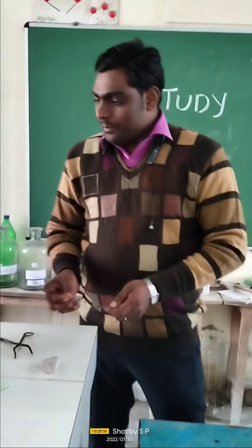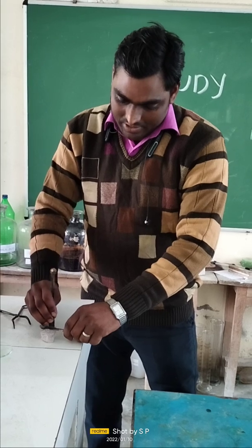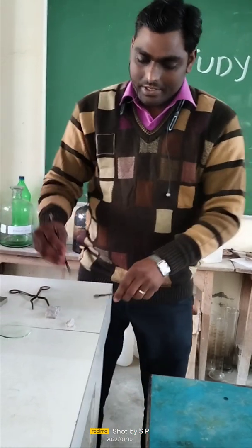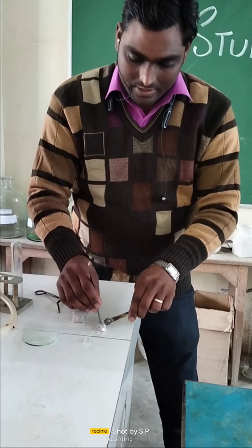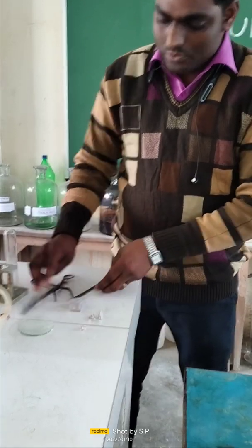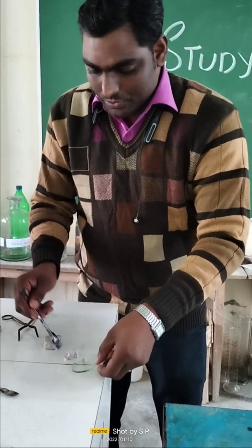I am going to cut it with the help of a spatula — just see. Since it is a soft metal, it can be easily cut with a spatula. This is easily divided into pieces. Just see the shining surface of sodium — these are the shining surfaces of the sodium metal.